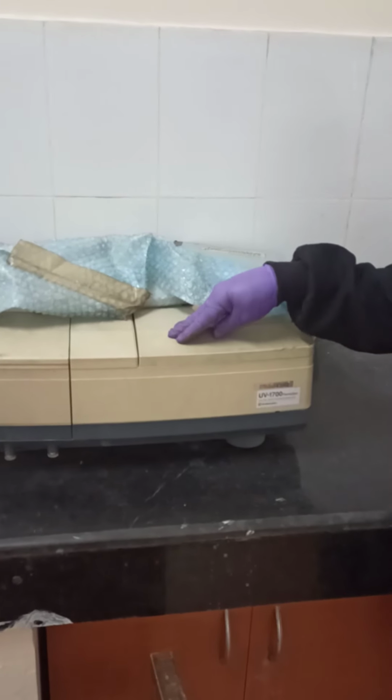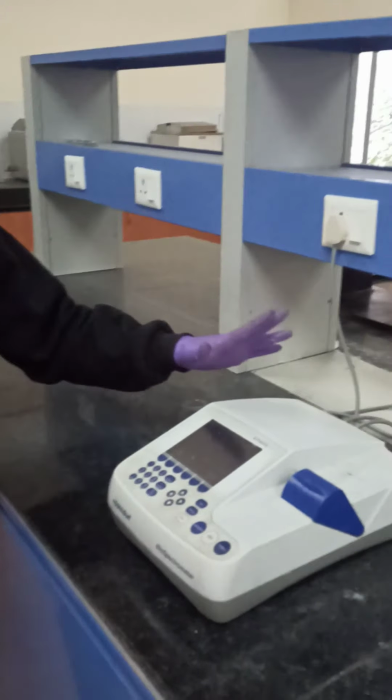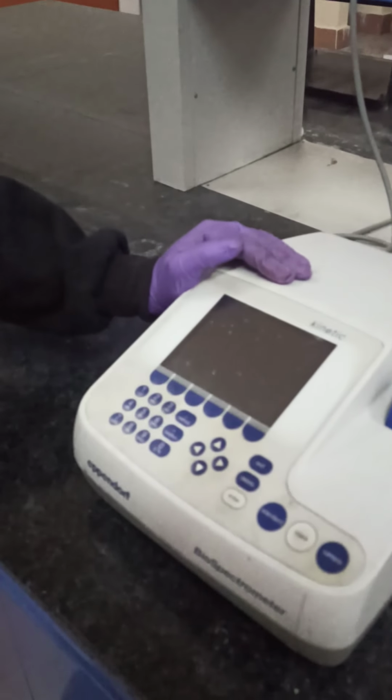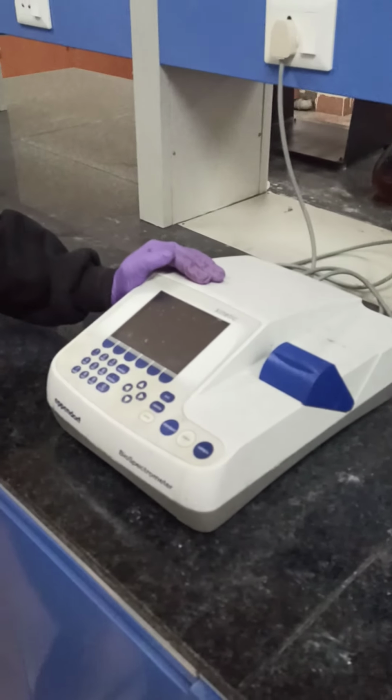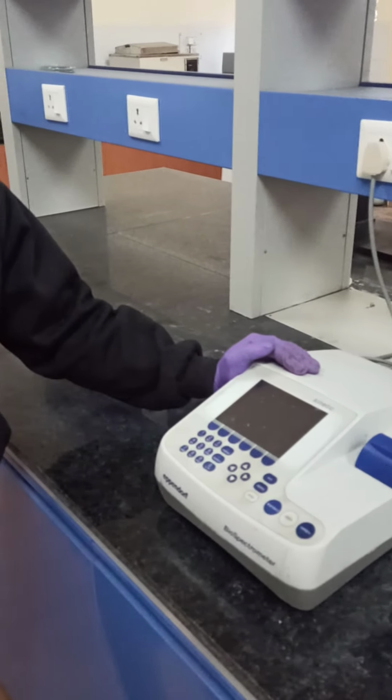I have this one, the modern model. At the same time, I am having the old model, which is also here. This is also a spectrophotometer. You know the function of a spectrophotometer for some of the analytical-related micronutrients.